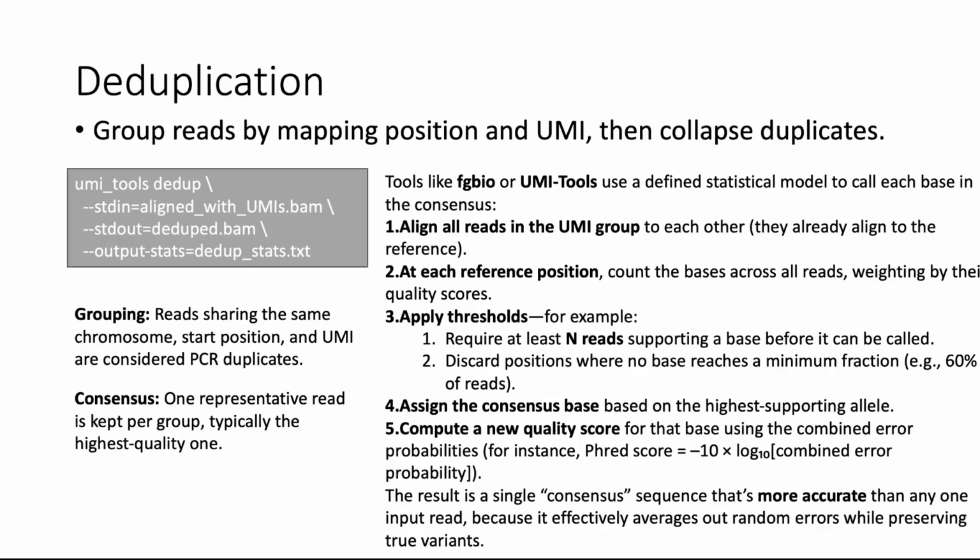It will allow us to group reads by mapping certain UMI tags together, and these groups share the same chromosomes, the same sequence in initial nucleotides, and they could be used for consensus analysis, and the resulting file will represent the highest quality reads from the same molecule from all reads in our library.